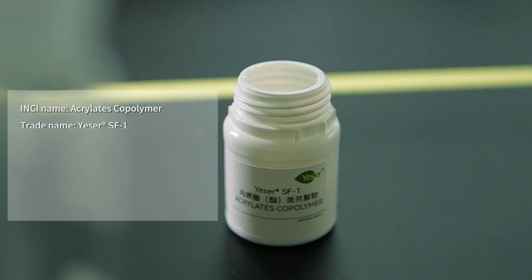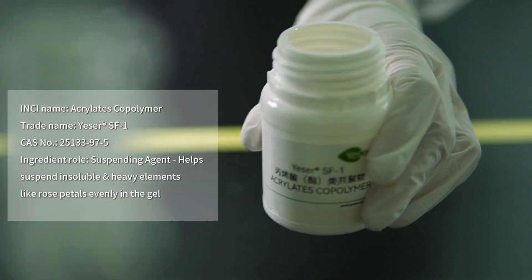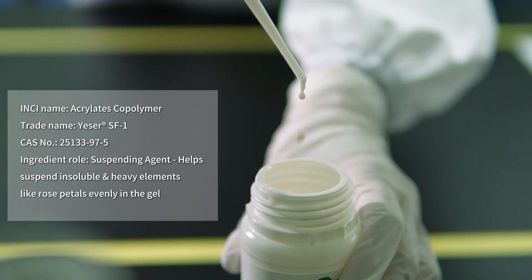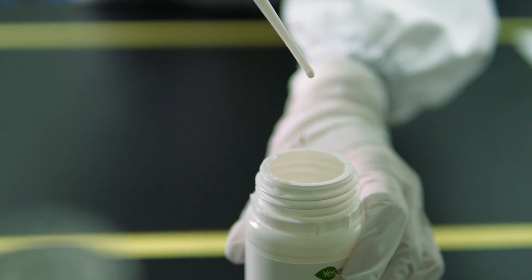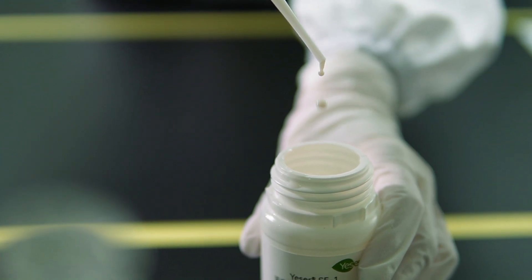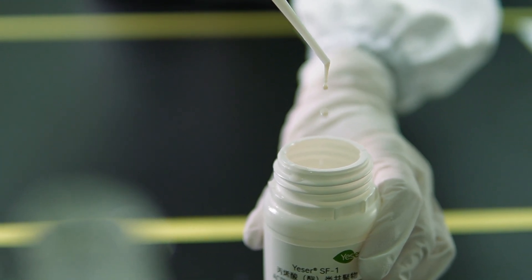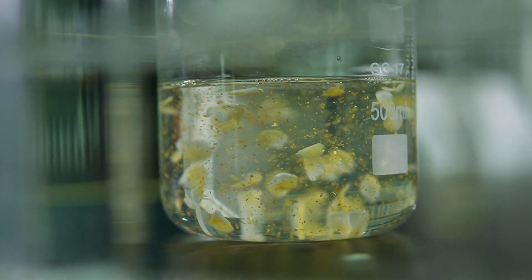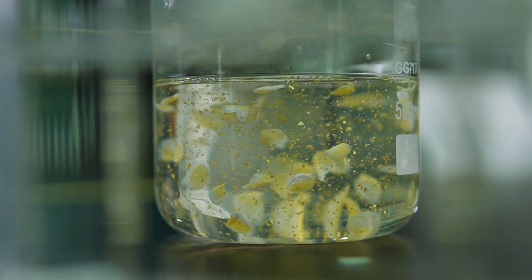Moving on to Phase D. We introduce Yeser SF1 Acrylate's Copolymer. This ingredient stands out for its remarkable suspending capabilities to hold heavy elements in liquid formulas. With 21 grams, or 7% of our total formula, it ensures that our bionic rose petals remain beautifully and stably suspended throughout the gel, creating the captivating visual effect unique to our Rose Petal Reverie Bath Gel.